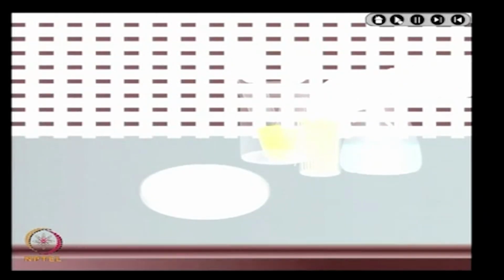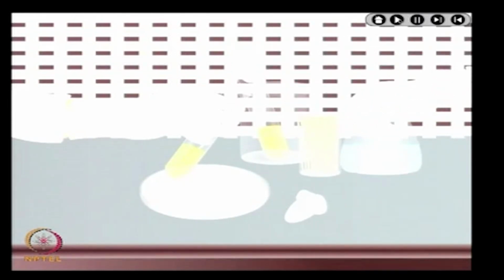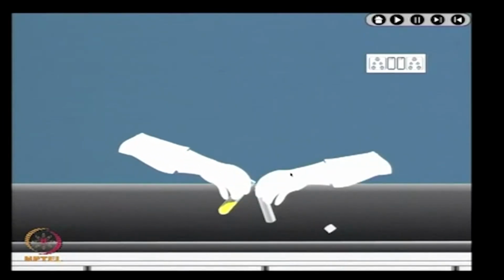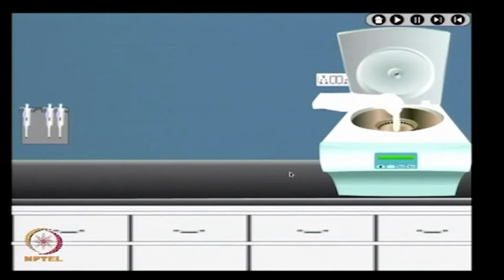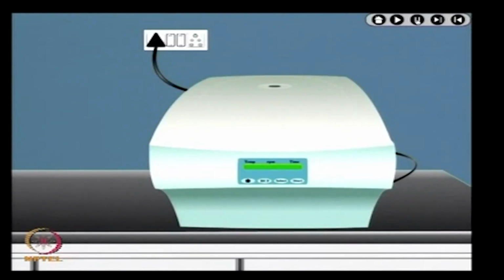For any bacterial proteome analysis, first you need to grow the bacterial cultures on LB media containing a suitable antibiotic. The proper 37 degrees temperature is provided for overnight or 6 to 8 hours of growth. The overnight cultures are diluted with fresh LB and grown at 37 degrees for 6 to 8 hours.